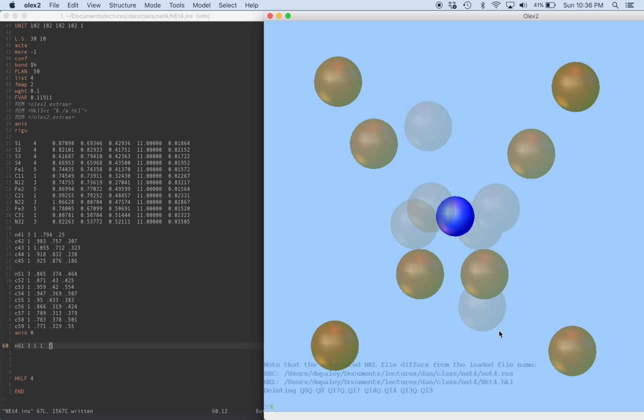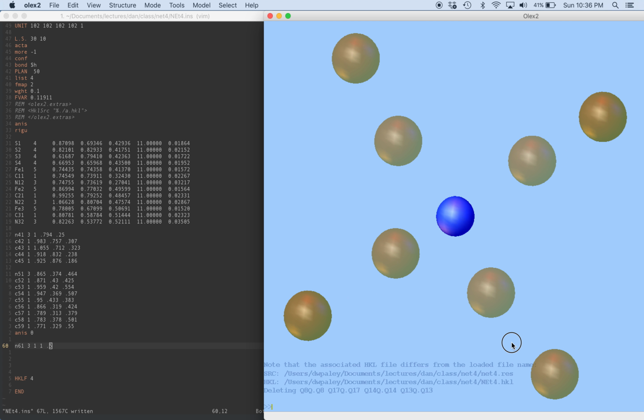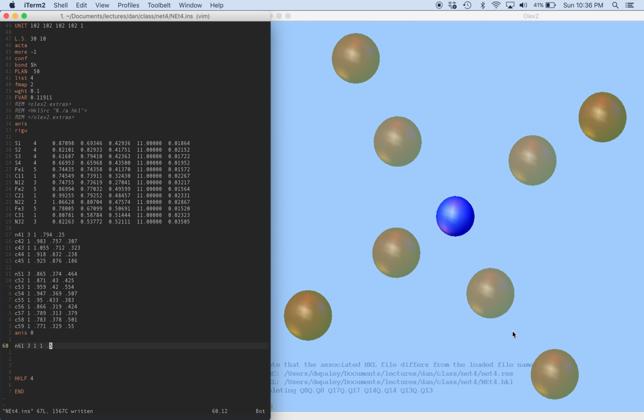Okay. I'm scrolling down a bit to get a few atoms out of the way, and now we can see our tetrahedron a little more easily. So we're going to remember that these go in a negative part number. They're on a two-fold symmetry element. I forget if this one is a rotation axis or an inversion center, but they both have a multiplicity of 2. So this occupancy is going to be 10.5. And these are going to be carbons 62, 64, 66, and 68.